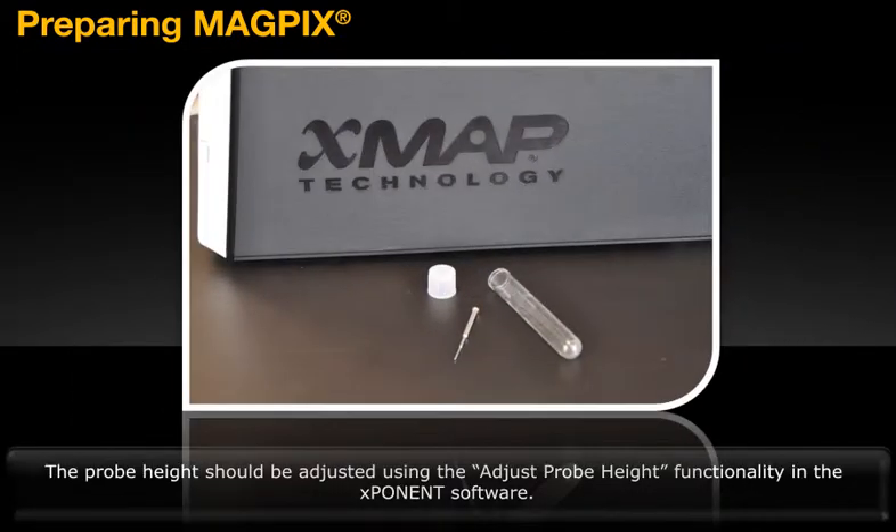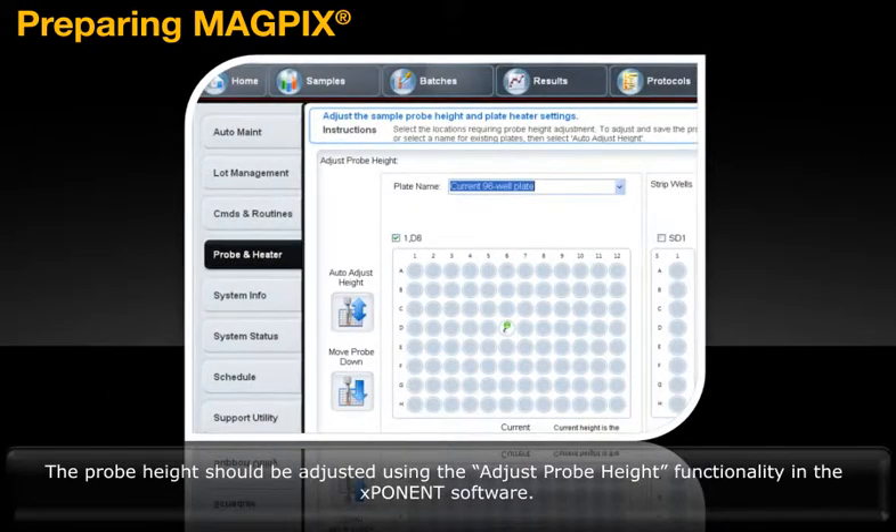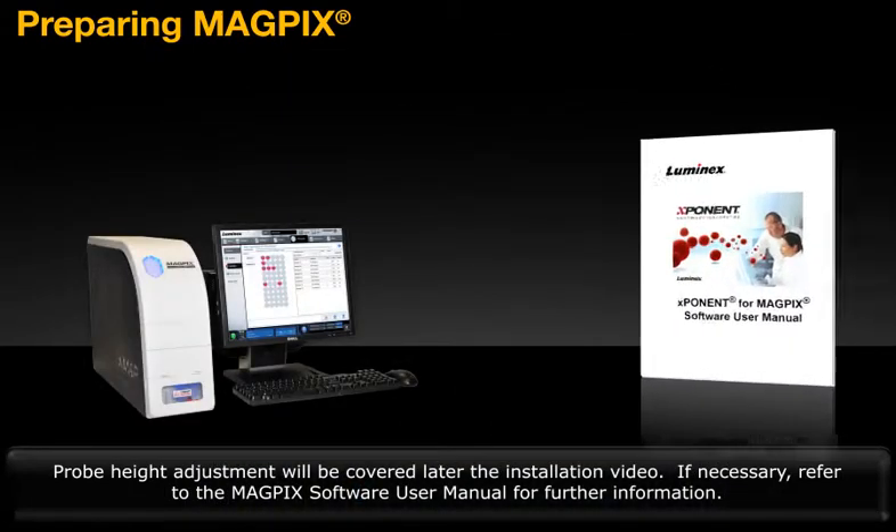The probe height should be adjusted using the Adjust Probe Height functionality in the Exponent software. Probe height adjustment will be covered later in the installation video. If necessary, refer to the MagPix Software User Manual for further information.